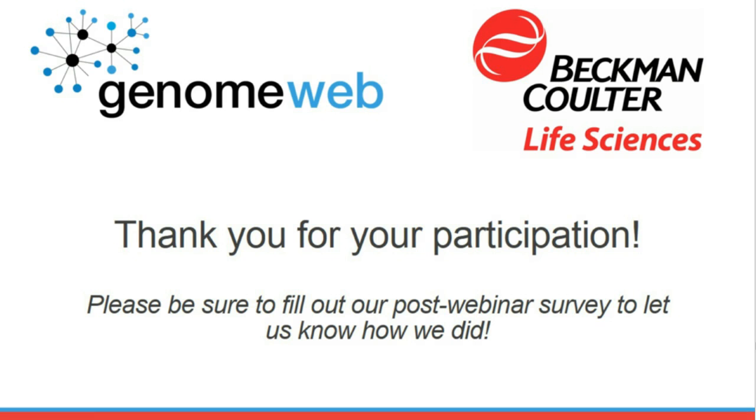But in our case, we haven't had much interest in that because we were working with GBS high throughput, high volume samples, thousands of samples. With nanopore, we do nanopore sequencing, but our number of samples is very low, just a few samples, tens of samples. And we haven't tested the Echo droplet transfer to see what will happen with DNA of large fragments.